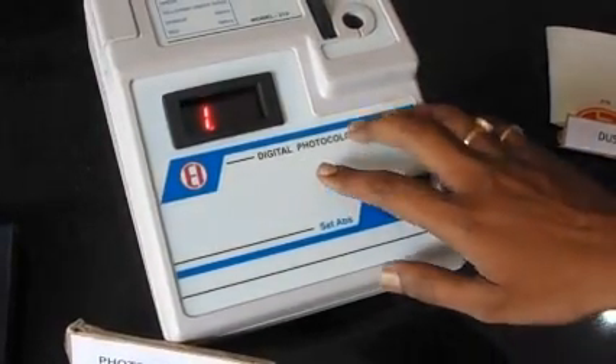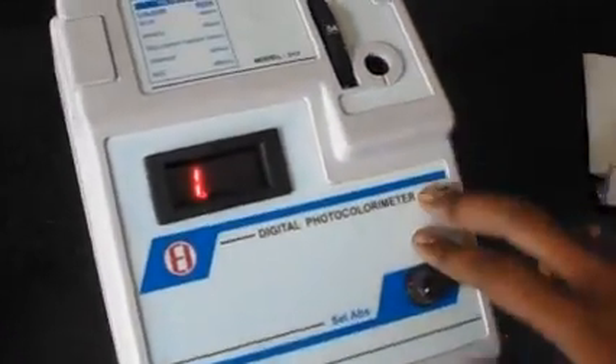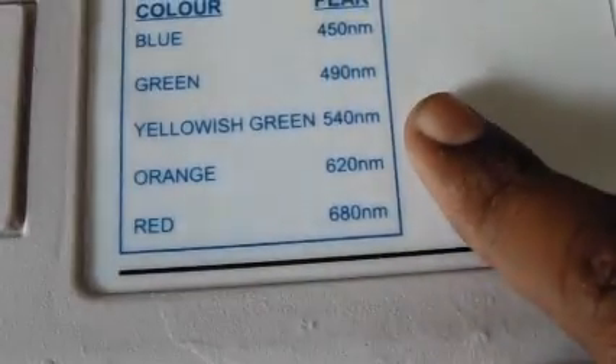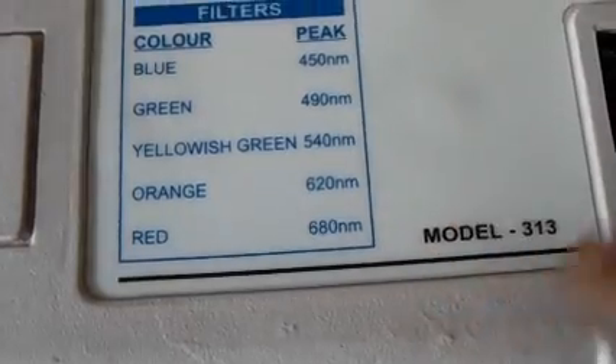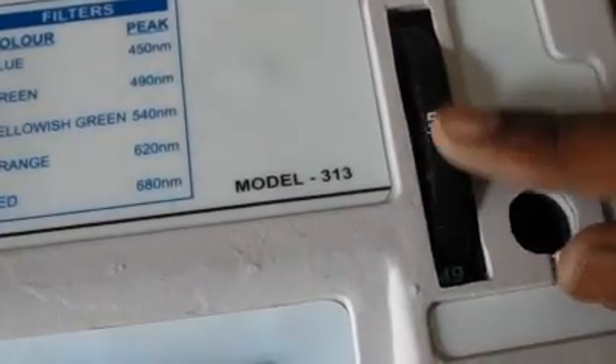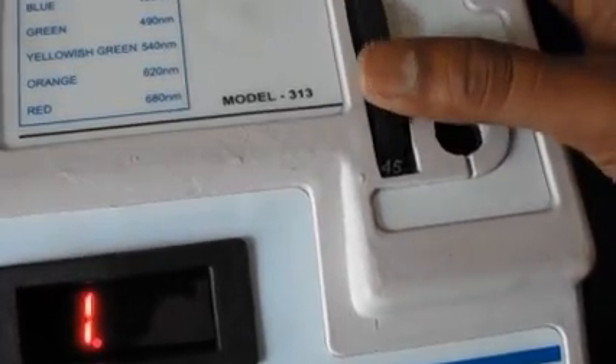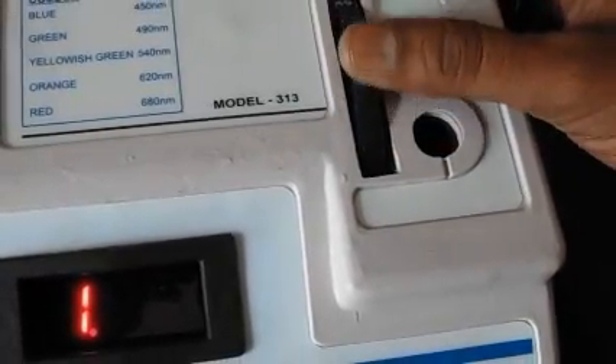This instrument includes a wide range of filters covering wavelengths from 400nm to 700nm in the form of built-in filters. The filter setting is controlled by a rotating disk.